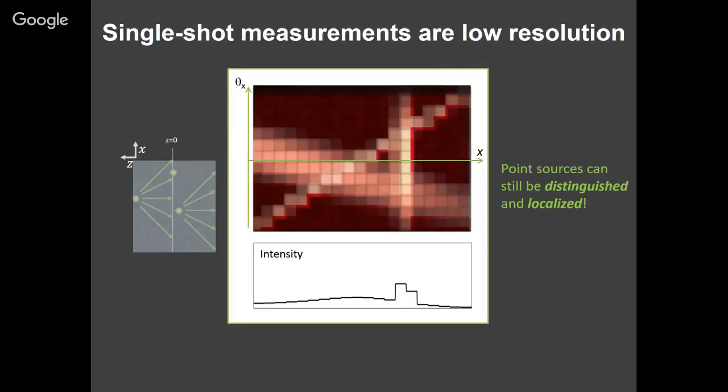And this is where it's actually a good application for a light field, because the light field always kills your spatial resolution, which is exactly why you use the microscope in the first place. So light field microscopy simply doesn't make any sense to me if you're going to kill the spatial resolution. But here it does make sense because your objects are much bigger than the diffraction limit. And so the idea is that even though it's pixelated, you can still very clearly fit to a line here. And so you can put this sort of pixelation sampling into your model and still fit this pretty well.